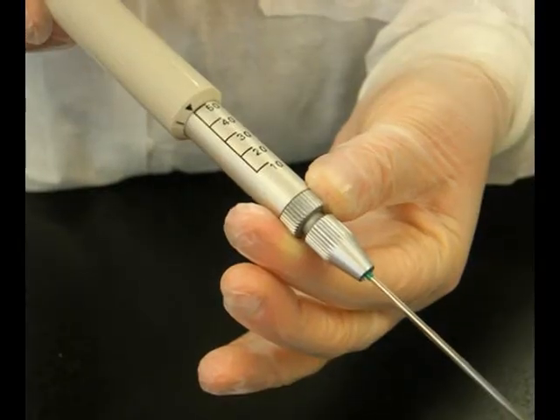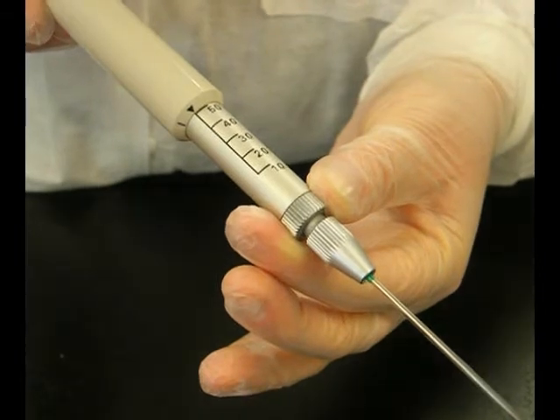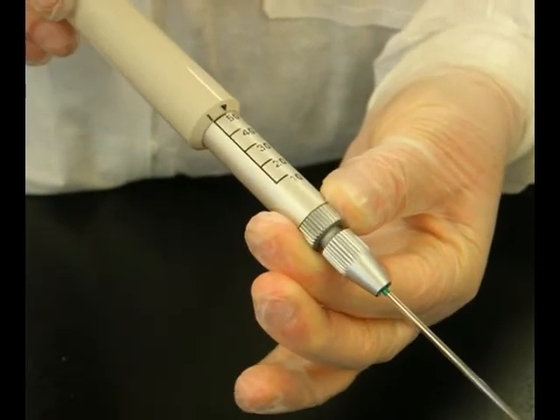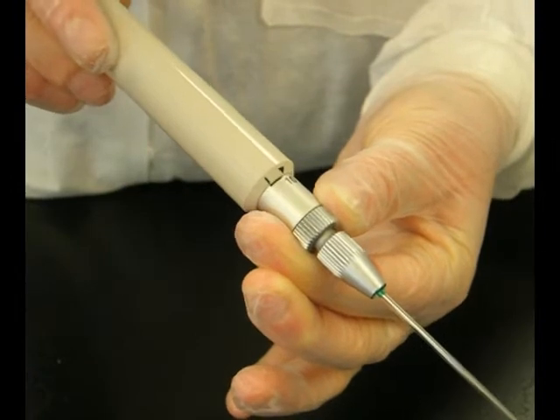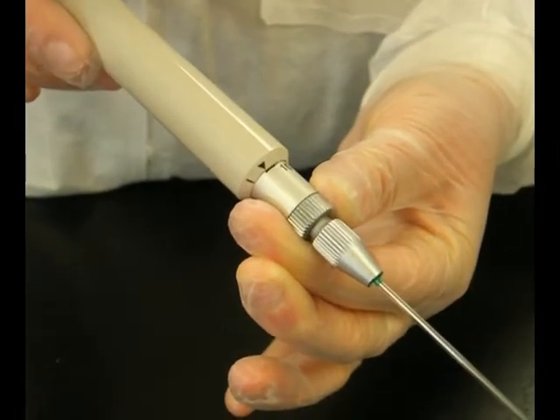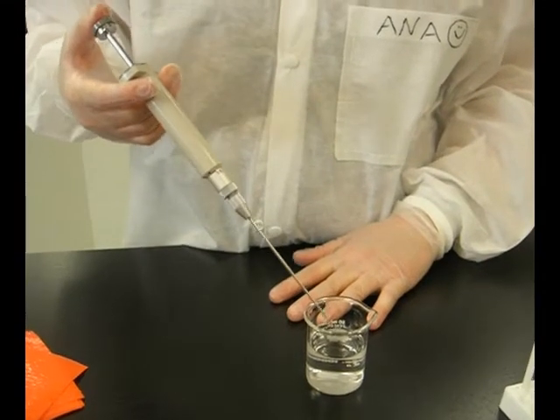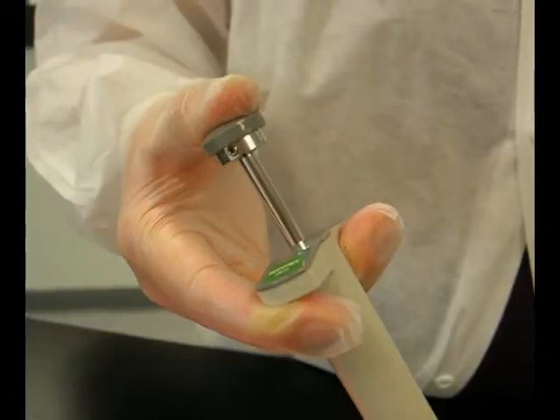Adjust the micropipette for the volume required. We are going to pipette 10 microliters. Unlock the barrel, slide it to the 10 microliter line and lock it.